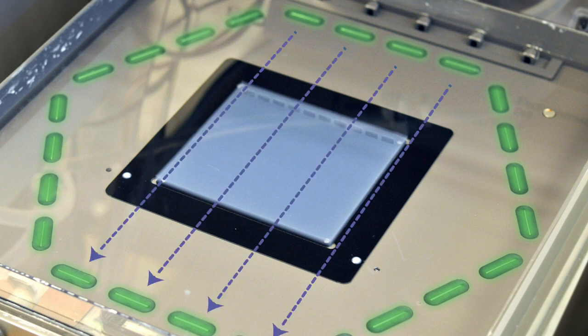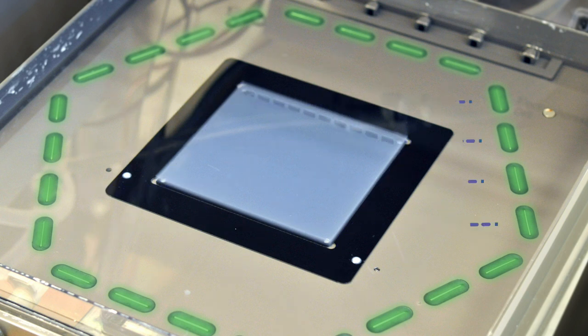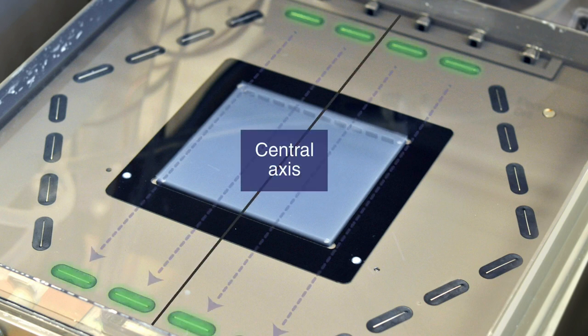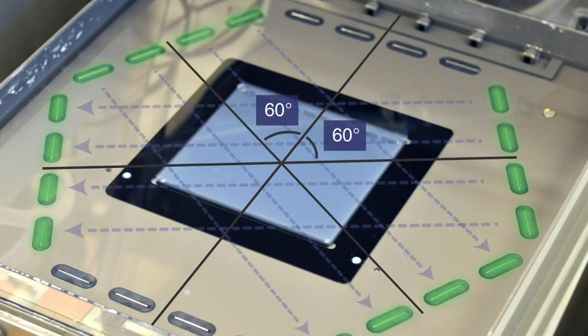This hexagonal shape of electrodes allows for the directional switch of voltage. The voltage is periodically switched among three directions, one that runs through the central axis of the gel and two that run at 60 degree angles on either side.